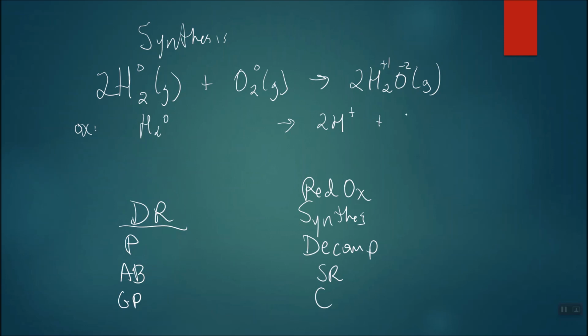So it goes up by losing electrons. So the electrons it gained from the sodium, it now loses to the oxygen in the air. And of course, oxygen is going to gain those 2 electrons to become O negative 2. So, 2 oxidation reduction reactions.